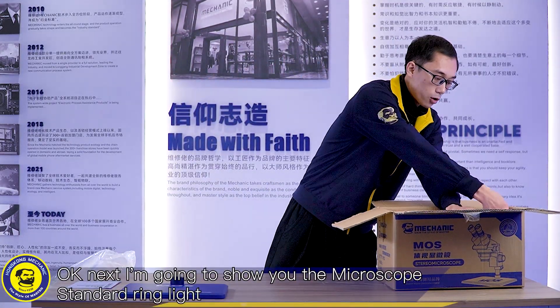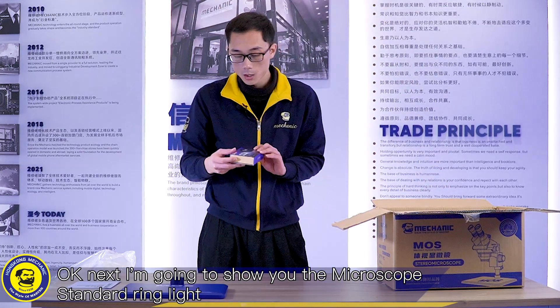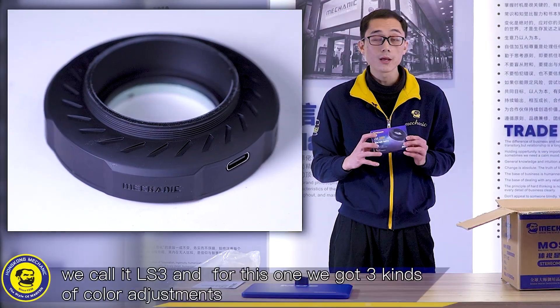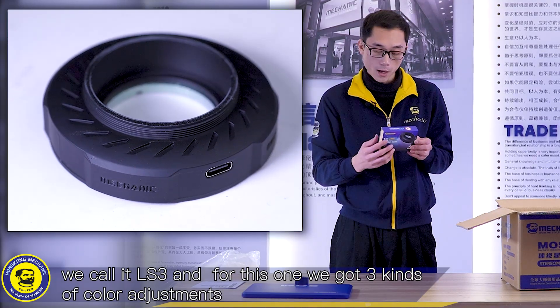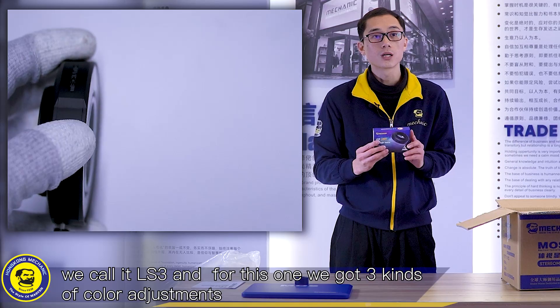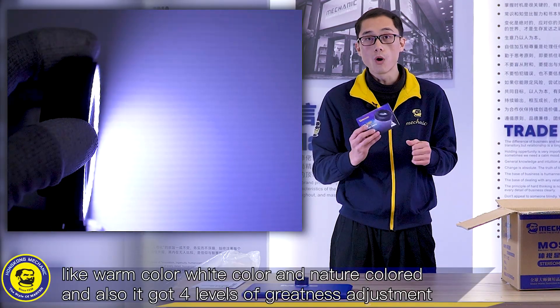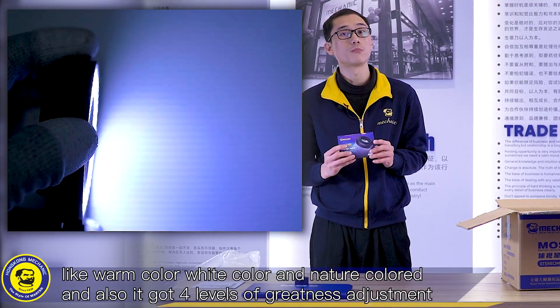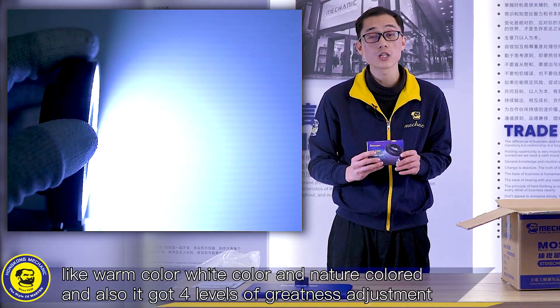Next I'm going to show you the microscope standard ring. We call it LS3. For this one, we got three kinds of color adjustment: warm color, white color, and natural color. And also it has four levels of brightness adjustment.